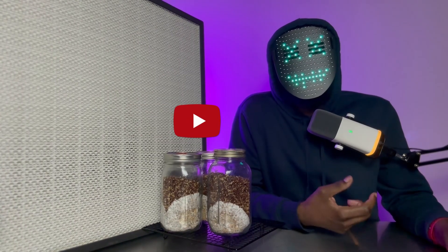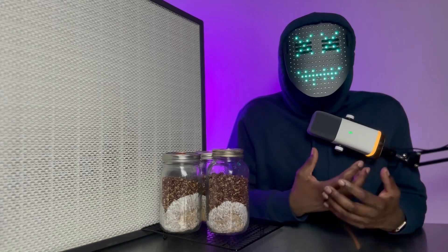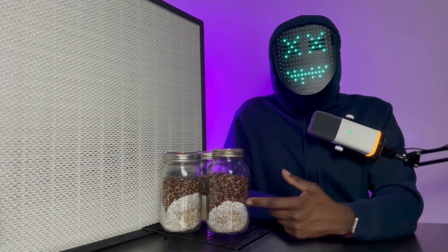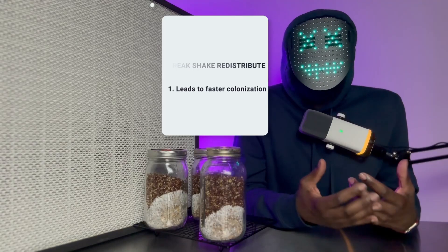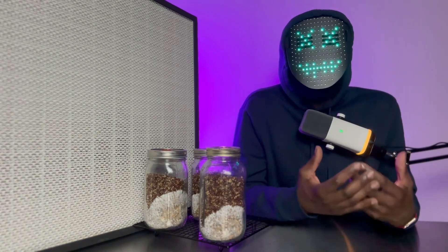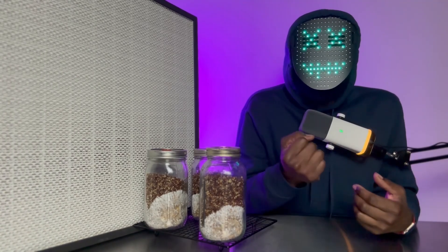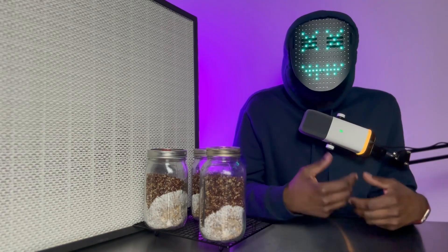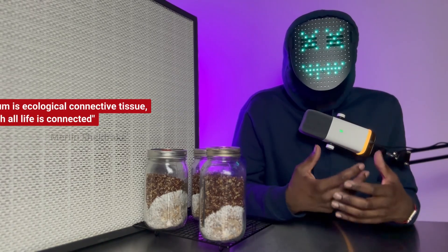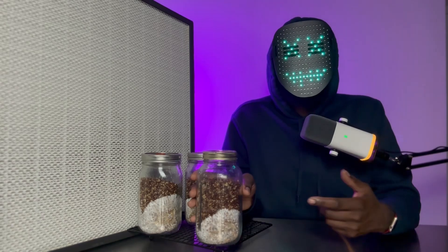I went out and purchased this cool time-lapse camera so that we can capture our mycelium in action. Here's what you need to know: breaking, shaking, and redistributing our colonized grains throughout our jar is going to lead to faster colonization. The reason for this is that the mycelium that has already grown out thus far on our grains has produced digestive enzymes specific to breaking down this grain. When you redistribute those colonized grains and they come into contact with uncolonized grains, those enzymes are released, leading to faster colonization rates.